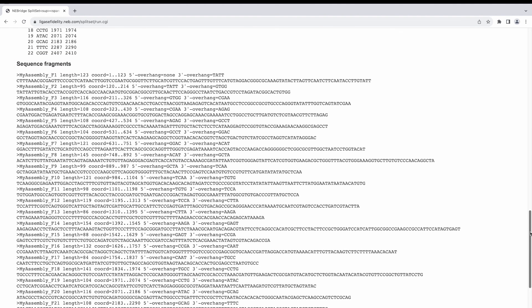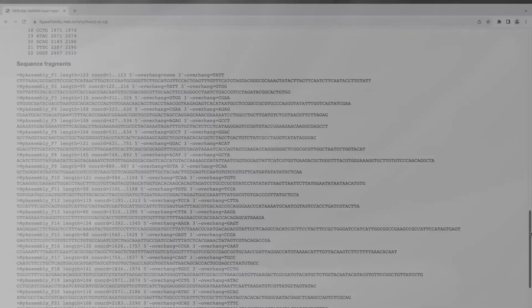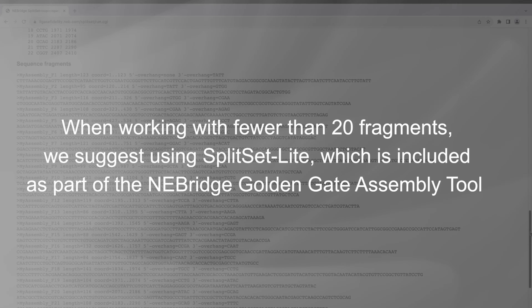Split Set can be used with any number of fragments. However, when working with fewer than 20 fragments, we suggest using Split Set Light, which is included as part of the NEBridge Golden Gate Assembly Tool, as mentioned previously.